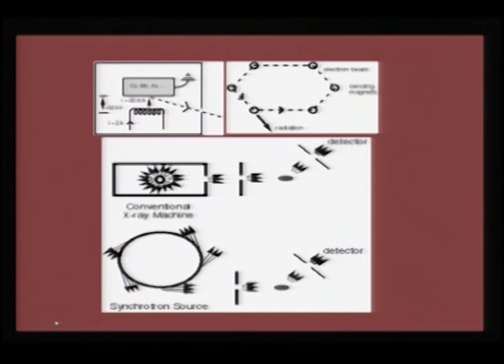Now, where XAS is becoming more crucial and more sophisticated, as I mentioned to you, is in the way we produce X-rays. Typically we use a filament to get electrons which knock on a particular target, which is copper, molybdenum or any particular metal, and when it strikes, characteristic X-rays come out of it, which we categorize as K alpha or K beta radiation.